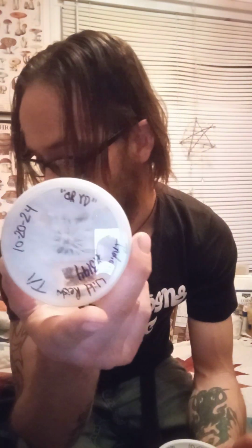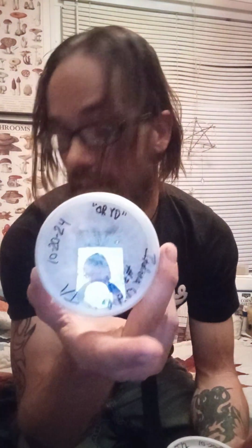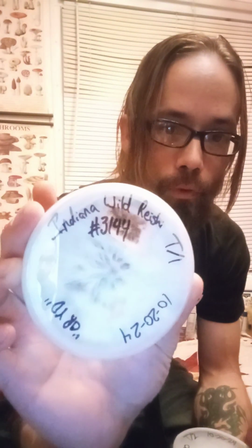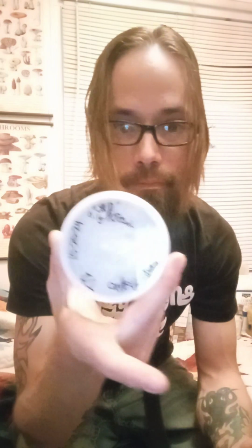And then let's see. This is ORYD, so that would be oatmeal, rice, yeast, dextrose. This did pretty well. This is Indiana Wild Reishi that I cloned. This is the first transfer off the clone plate. Even coming from the wild, man, it really ate this up. I liked it. Here's some Piapino.